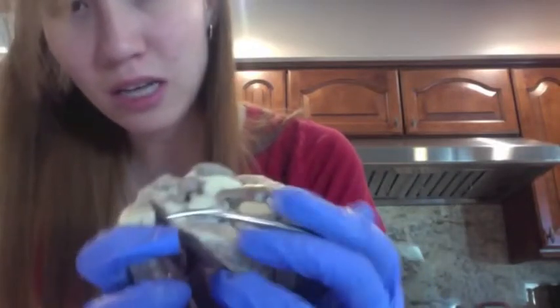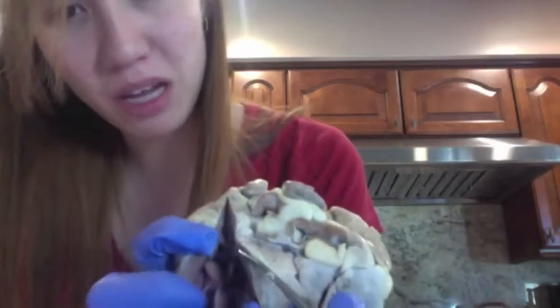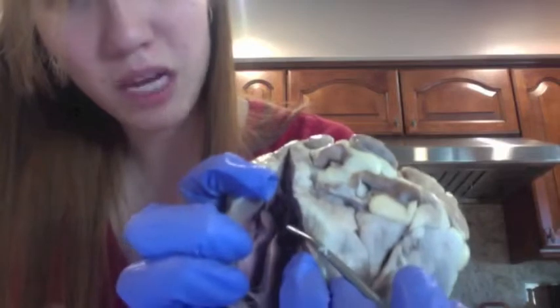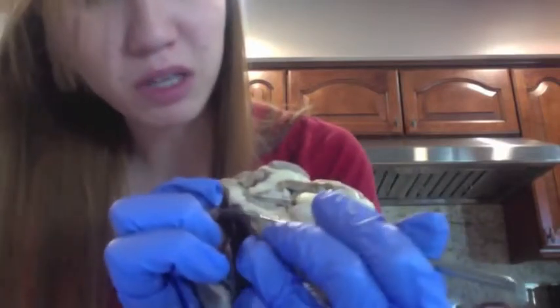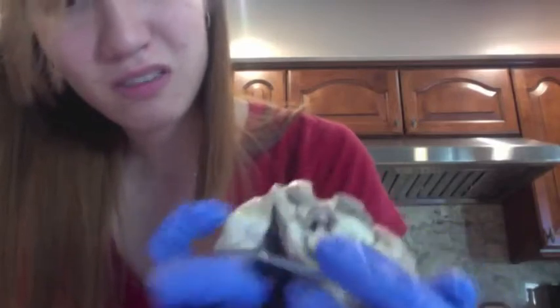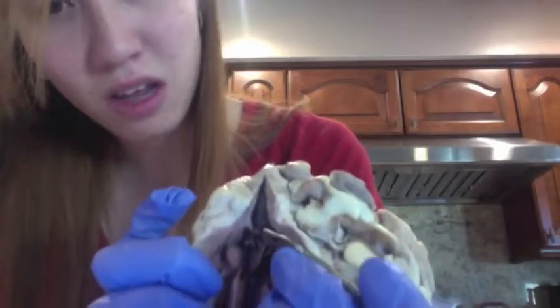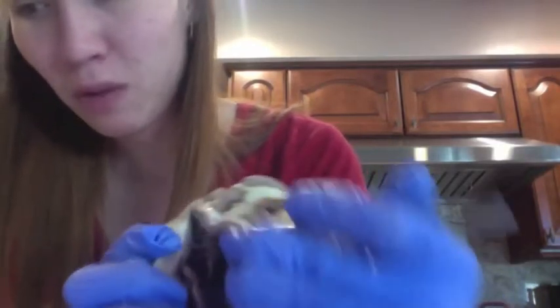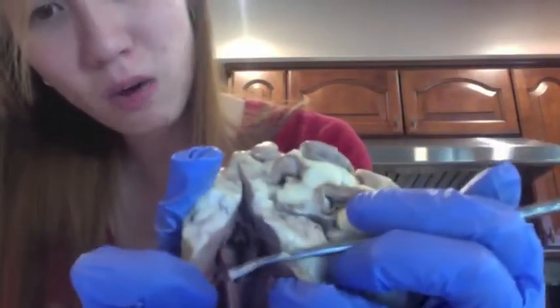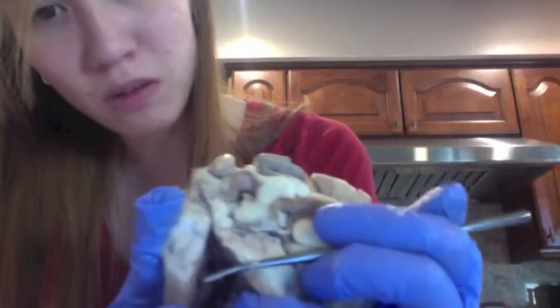There's the chordae tendineae, which extend from all the bicuspids. And you can kind of see the stringy stuff coming down. We have the cusps of the valve, which I kind of already said. They were the white stuff right up there. We have the papillary muscle, which is where the chordae tendineae kind of connect to.